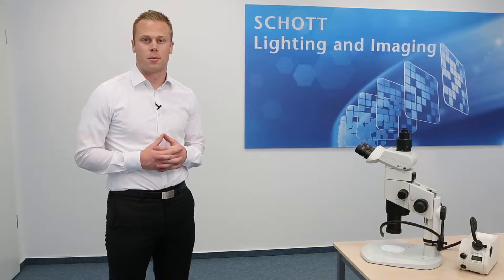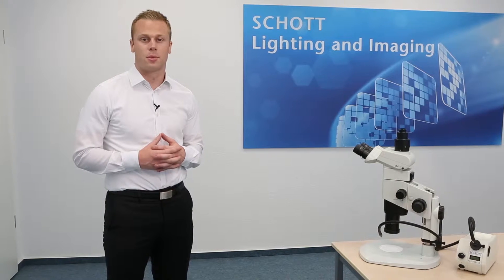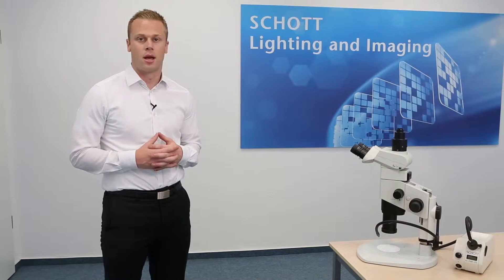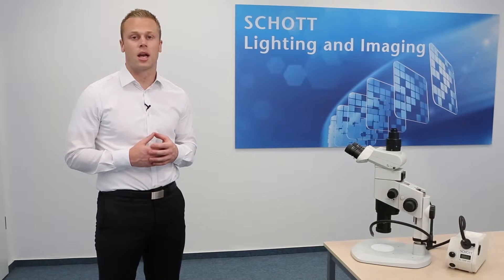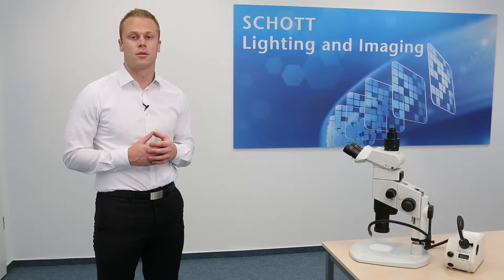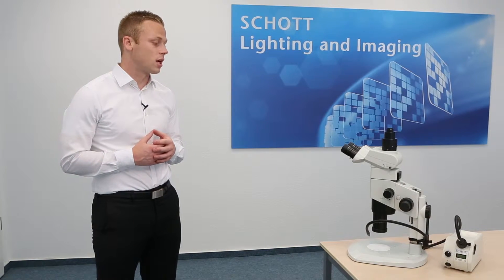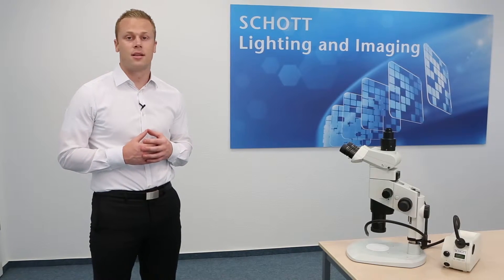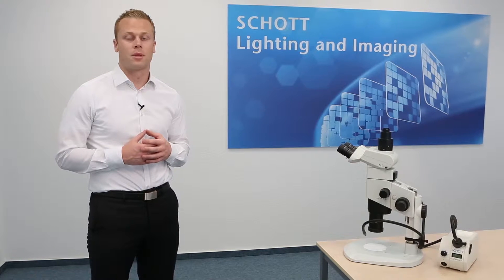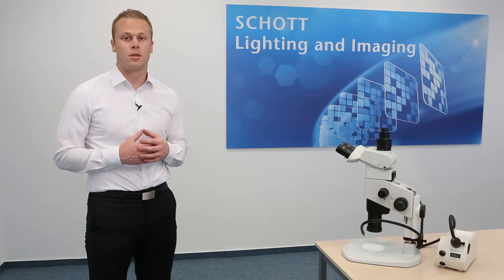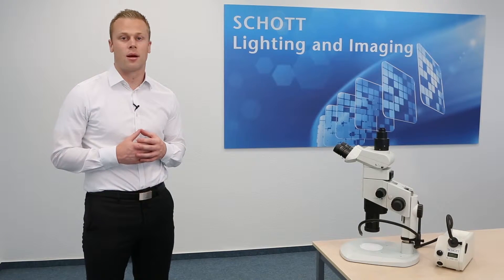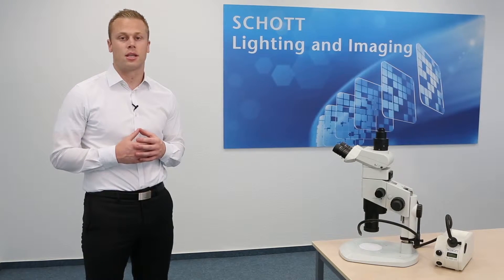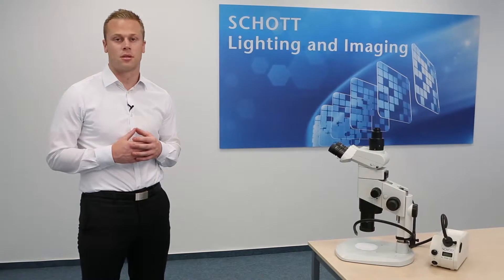Welcome to Schott Microscopy. My name is Preston Zimmerman and today I'm going to be demonstrating the KL2500 LED light source. The KL2500 LED is an innovative fiber optic light source which uses cold light to illuminate objects in industrial and life science applications.